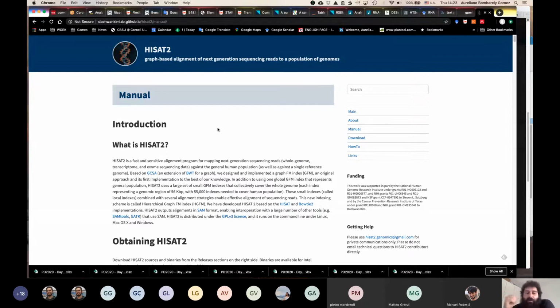That being said, usually when you are running the commands, the most common error is first, you are not in the right directory, so the command cannot access the file. I think that some of you already passed that level. So comes the second option. The second option is while you were learning or you were doing something else, maybe you have overwritten or messed up one of the files that you need to work with. As some of you already wrote me an email saying, I have this error, okay? And that is a common error too.